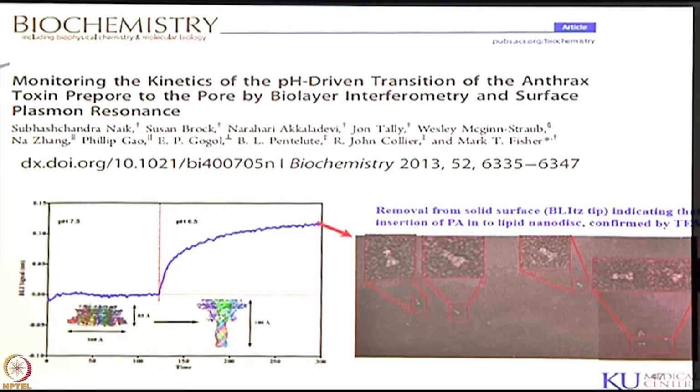Because when it comes to SPR, when you elute the complex mixture and collect it, your sample is more diluted, so you have to concentrate it before you perform the further studies. Here, you can enrich on the dip in the well itself.